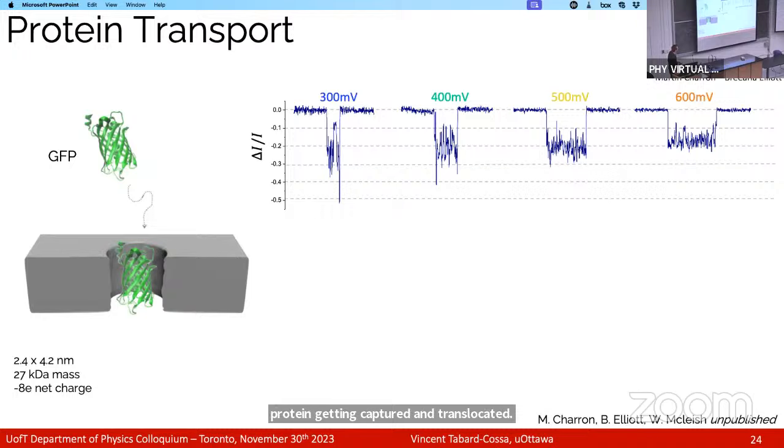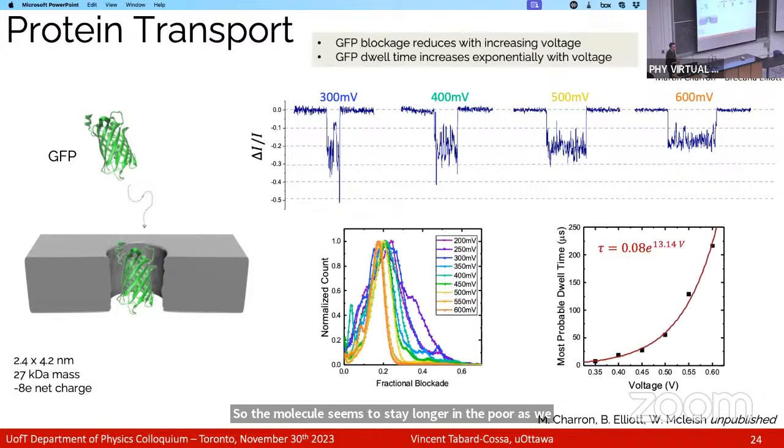But if we zoom in and look at each event more precisely, as a function of voltage or force, what we see is something a bit counterintuitive. We see that the signals become shallower with increasing force, so they're not as deep, and the signals also become longer with increasing force. So the molecule seems to stay longer in the pore as we are increasing the voltage. This is shown here in this figure.